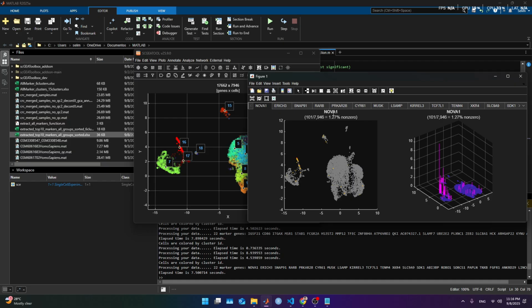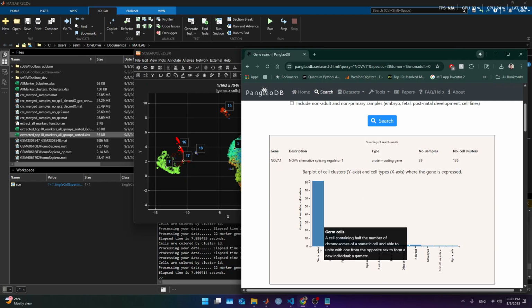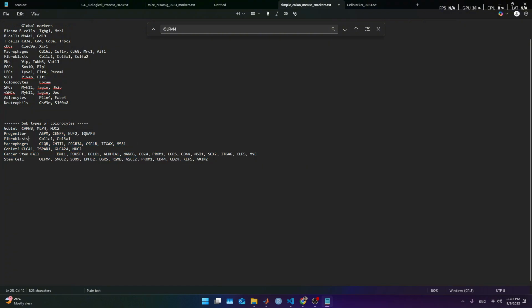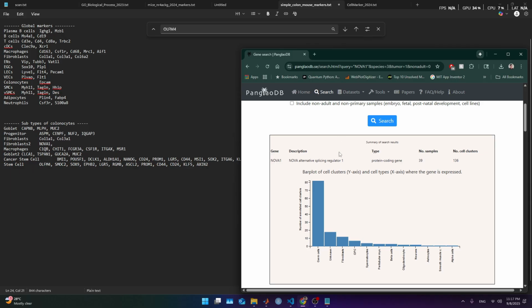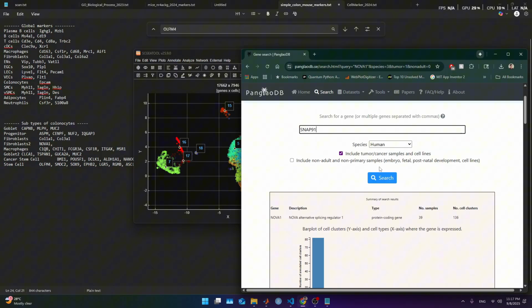Okay, that's really lighting up. And let's ask Panglao. Germ fibroblast. Okay, that's fibroblast. If we use that marker now, here in the fibroblast 2, now we might get it better. Now let's go back here and there. That I haven't seen it before. This is lighting up good. Let's see if it is related to fibroblast.